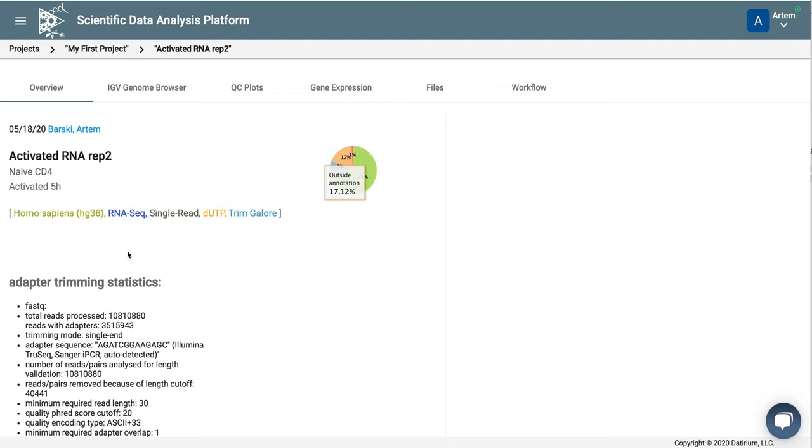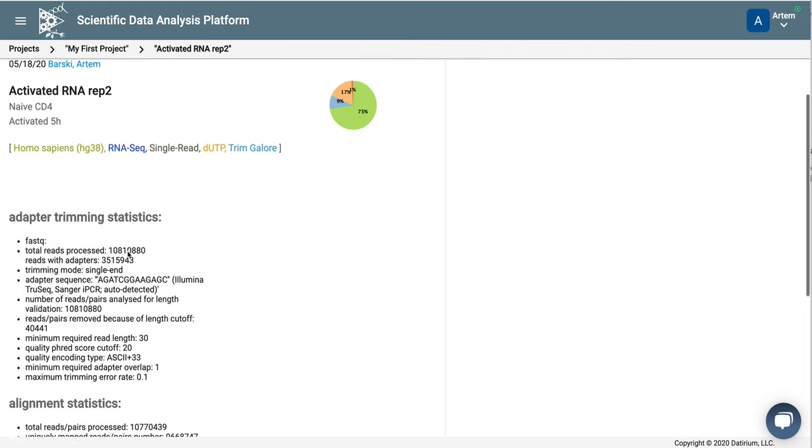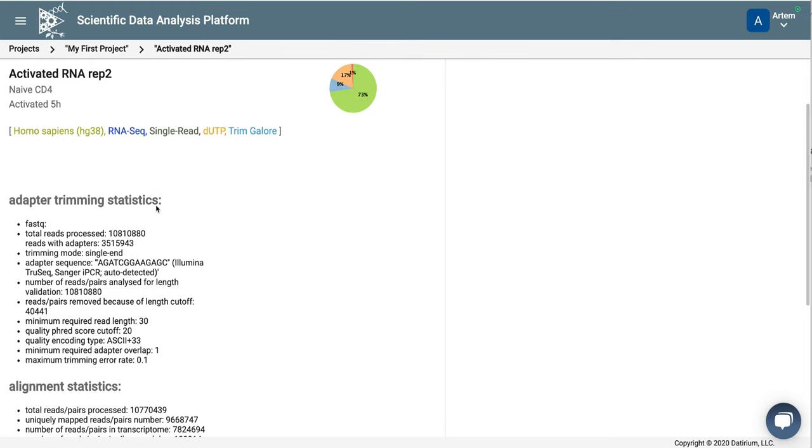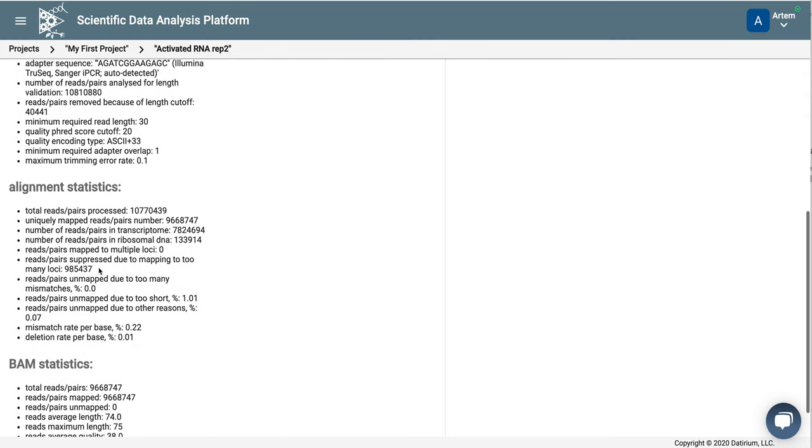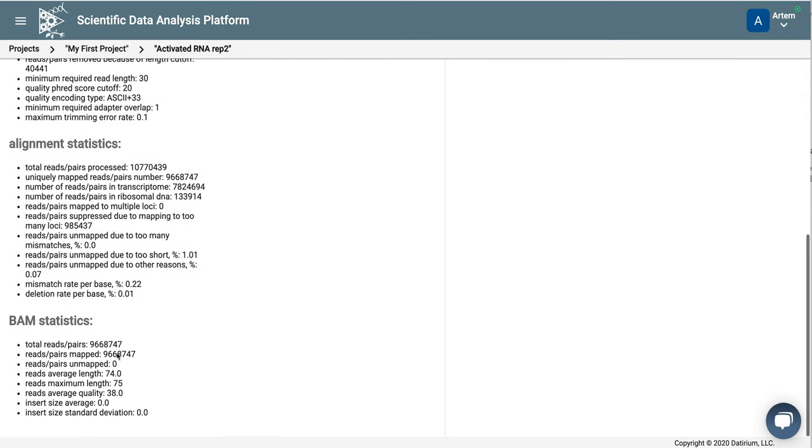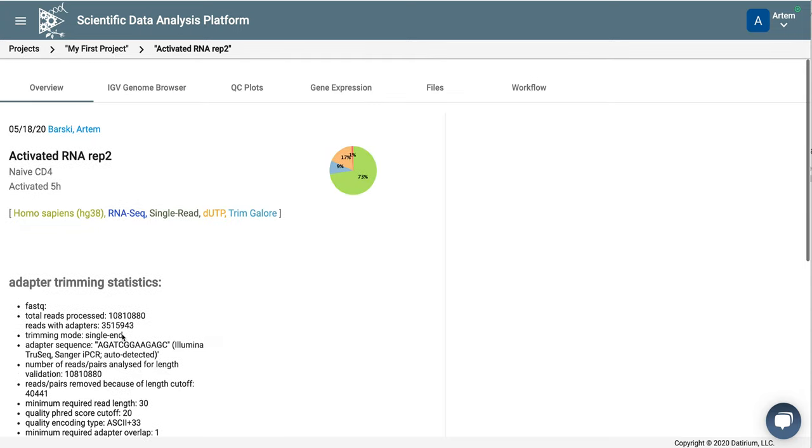Let's look at other quality controls. So here you see the number of reads, the reads with adapters, and TrimGalore correctly identified them as Illumina TruSeq adapters. You can see statistics for alignment, for the BAM file, and so on.